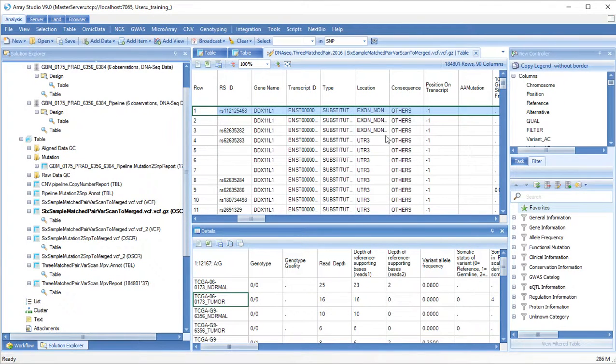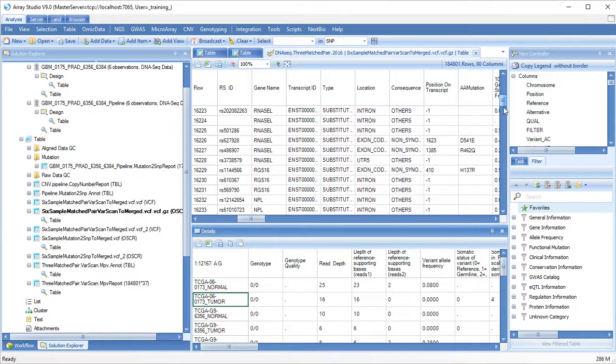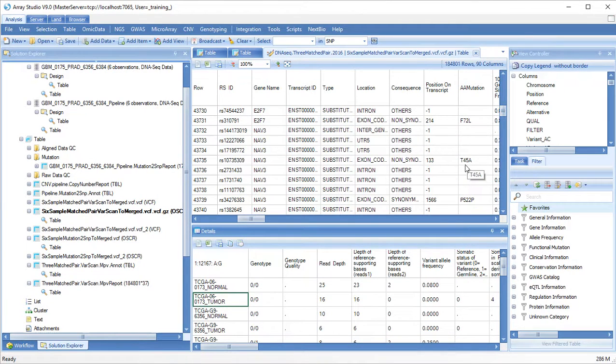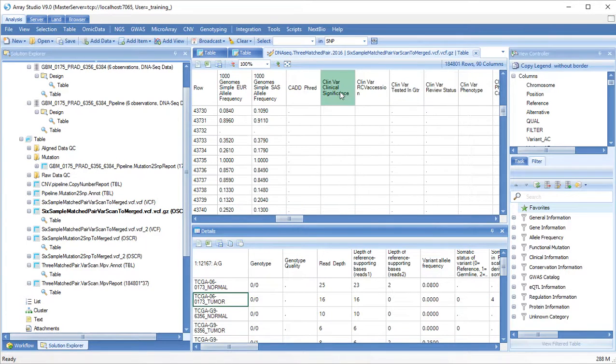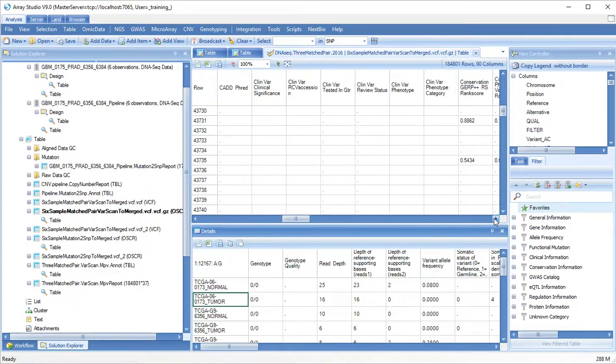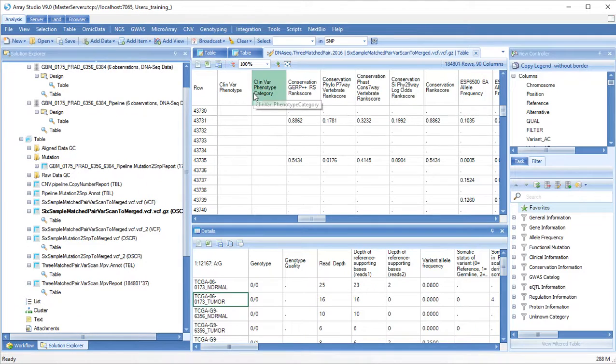Based on the gene model, you will also find predicted changes, including the location in the gene model, the change to the protein, and information from the selected online annotations, such as 1000 Genomes frequency, and clinical significance. You can filter by gene name or by functional annotation.